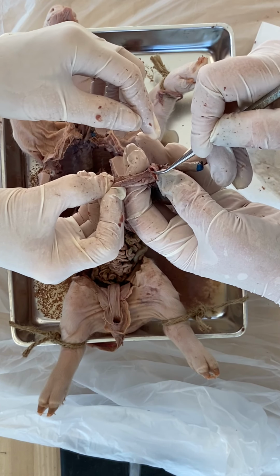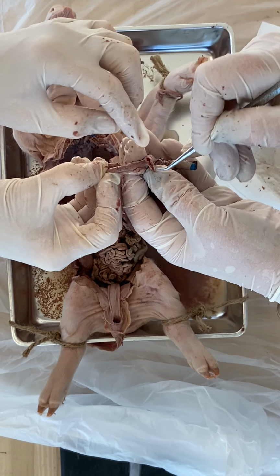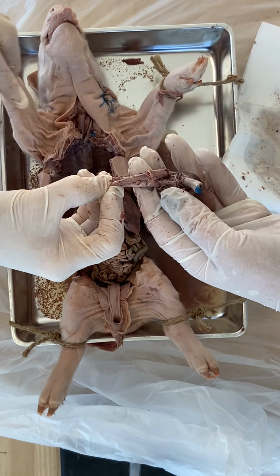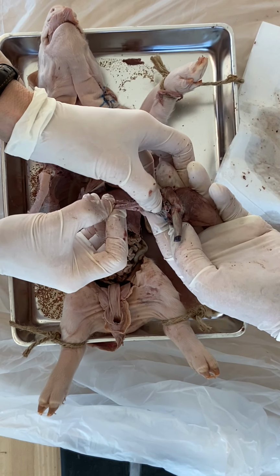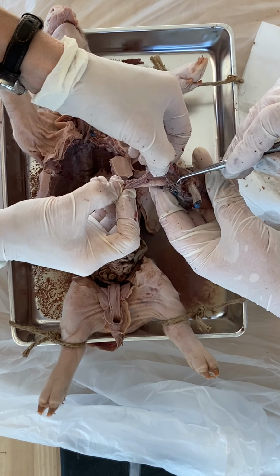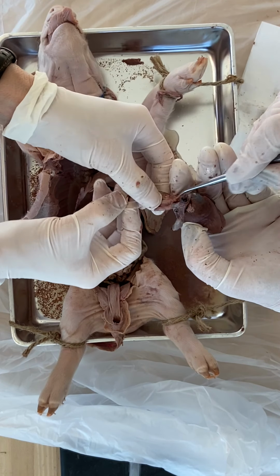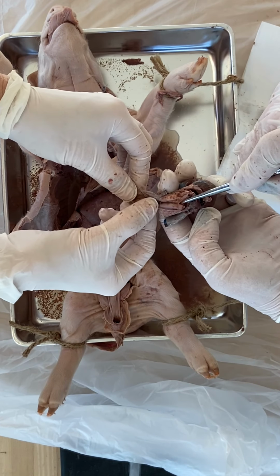Just look, there's the division in the middle. So one that way and one that way. Yes. We nearly got the bronchi. Well, it has to be because it's going down lower. You wouldn't have trachea unless I think we pulled it through. I think it was up here and we pulled it through. Oh, okay. So there it is.